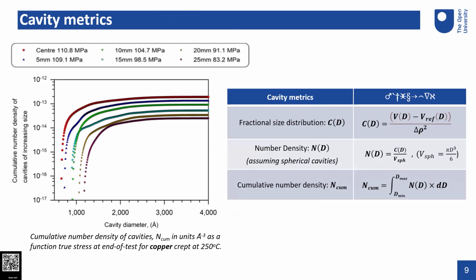If you assume the cavities are spherical, then you can calculate the number density of cavities, and from there the cumulative number density of cavities.